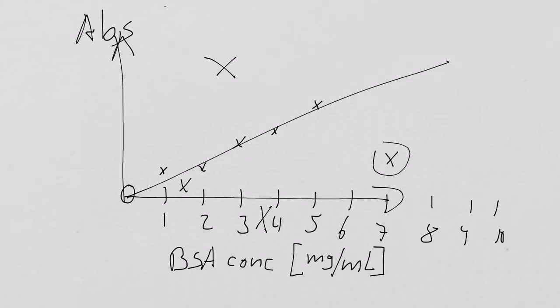You can check if you order according to bluish. This would be a typical example of the blue purplish color all over the place. In this case, you have enough time to repeat the experiment. Yeah? If that happens, talk to me.